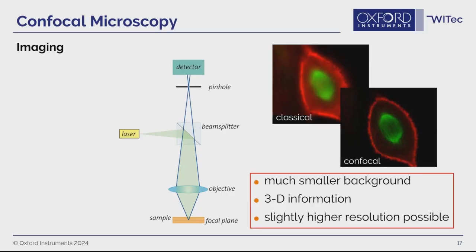For example, when we have a look at the epitaxy layer, the 3D information can help us to distinguish between epi layer, buffer layer, and the substrate. And of course, the higher resolution in XY is also beneficial.